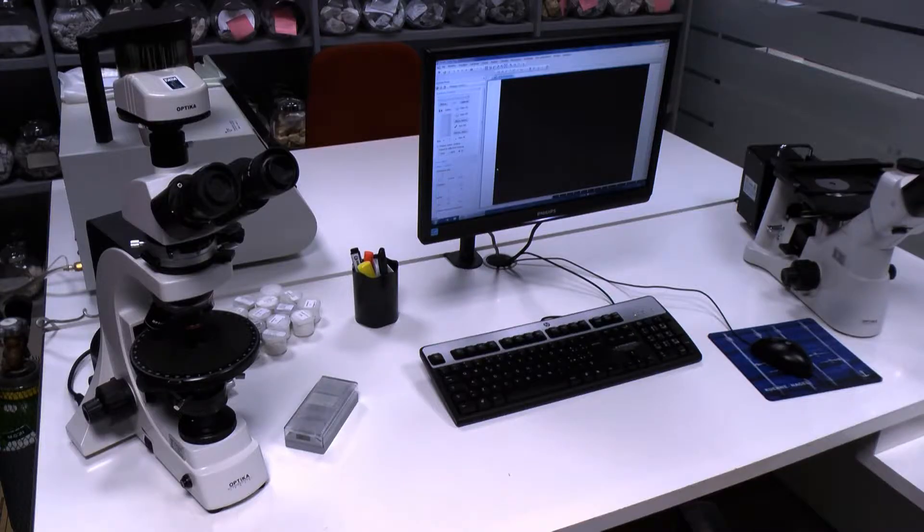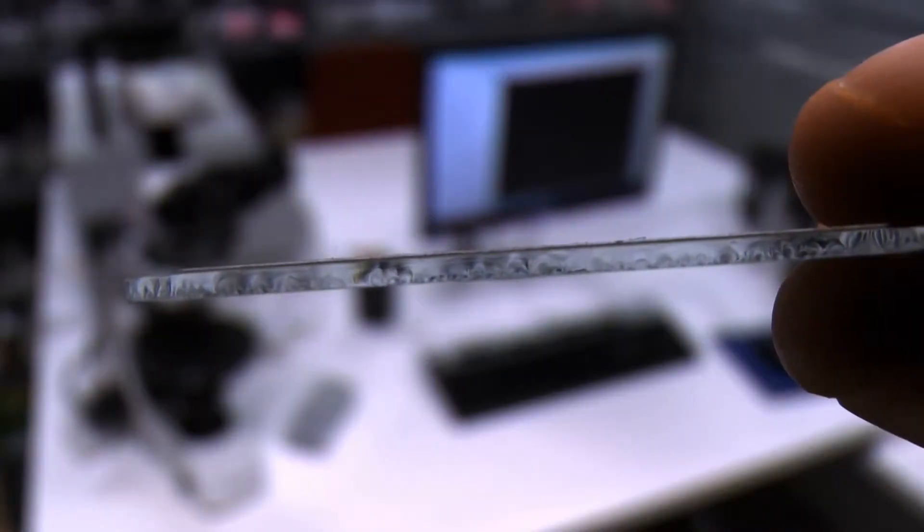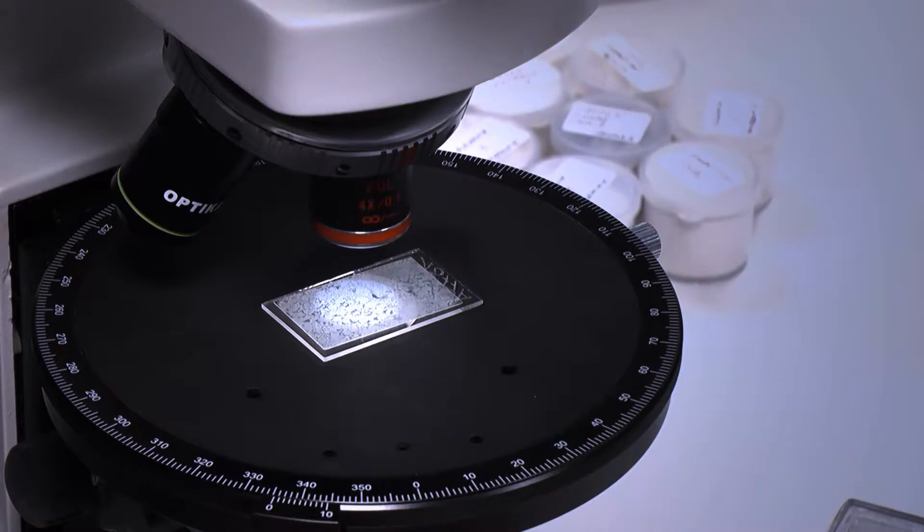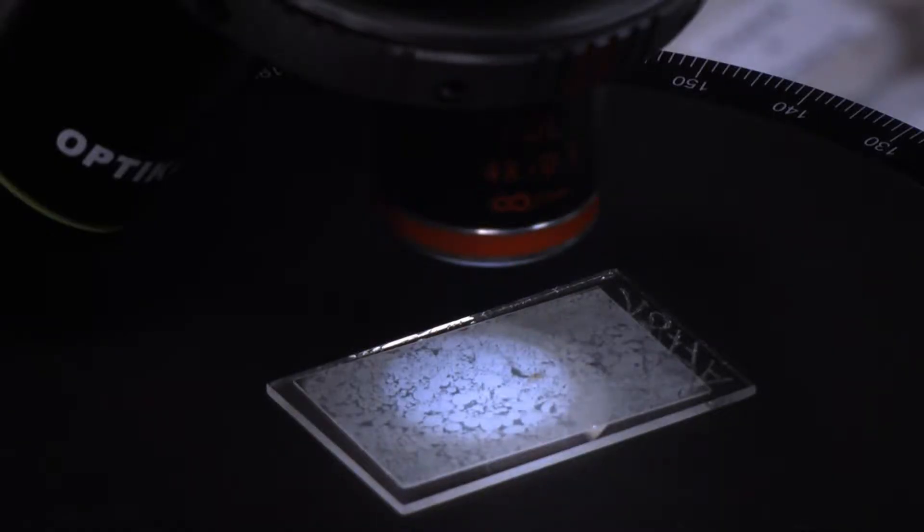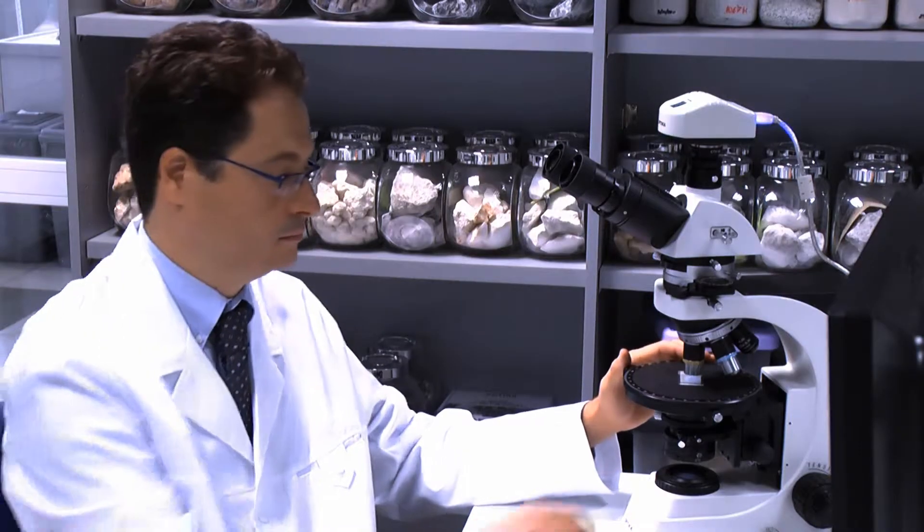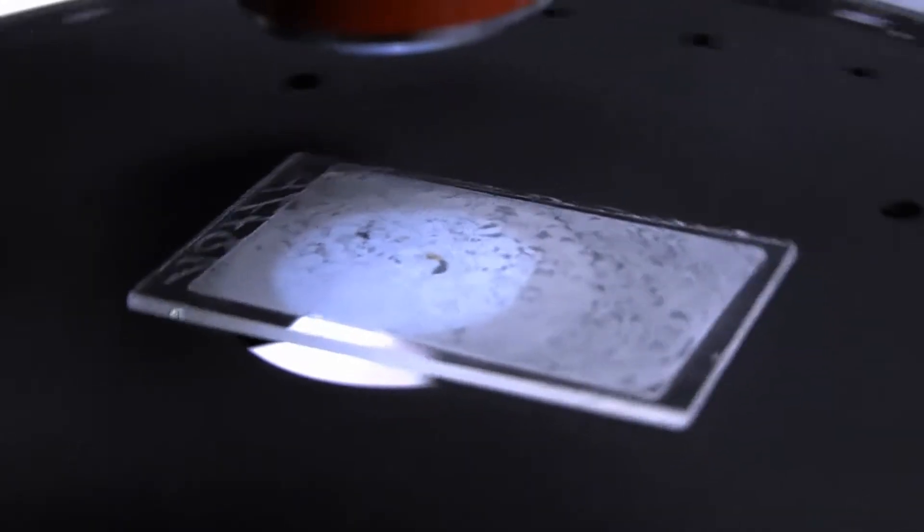The same sample is finally used to create a thin section of 30 microns thickness which is analyzed using a polarizing microscope. This is the so-called petrographic analysis, which is generally used for the mineralogical and microstructural analysis of the stone.